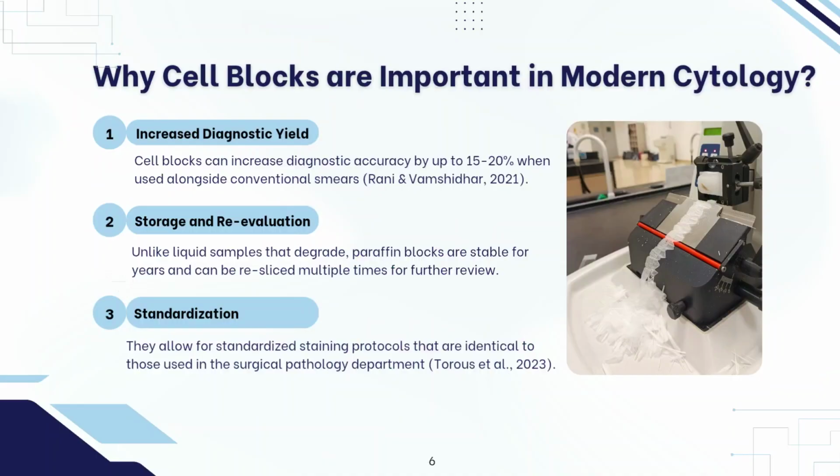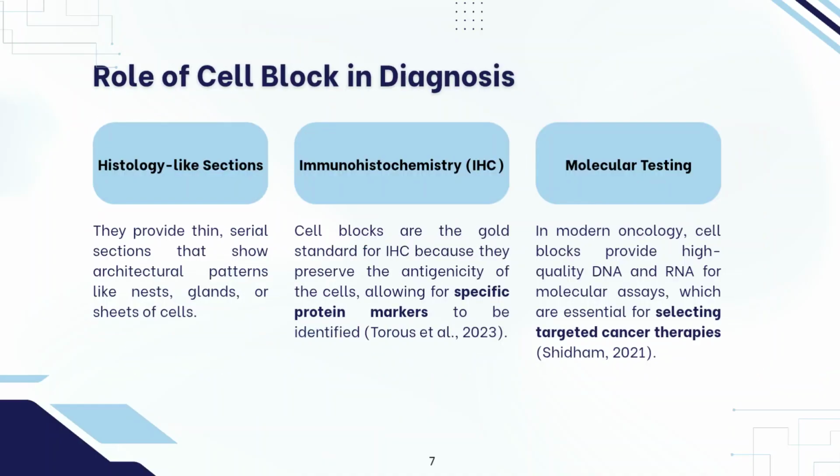Second, they offer superior storage and re-evaluation capability. Unlike liquid samples that degrade over time, a paraffin block remains stable for years and can be sectioned multiple times for further review. Third, they allow for technical standardization using the same staining protocol used in the surgical pathology department.